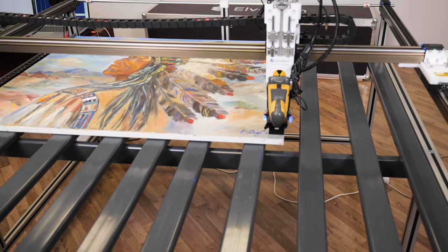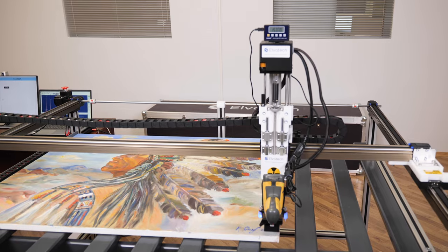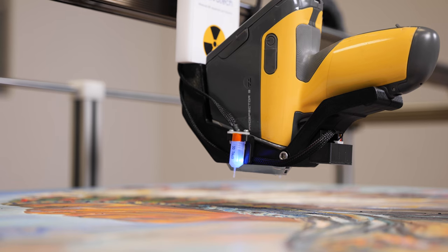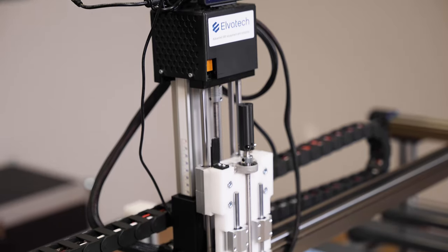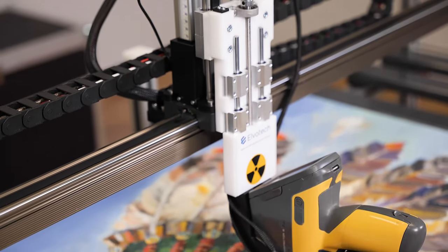The Elvox Art spectrometer is ideal for the precise identification of elements such as titanium, lead, and chromium in mineral pigments, which plays a key role in authentication and research of techniques and materials used by artists. The use of the non-destructive XRF method ensures that valuable historical and cultural artifacts remain uninjured, preserving their value for future generations.